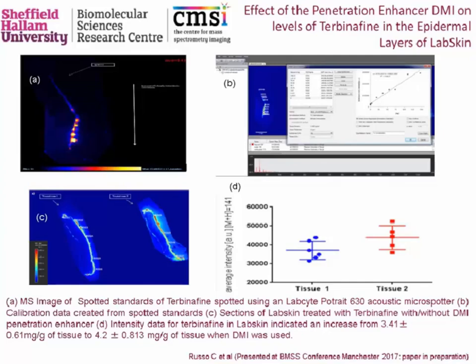And what we can do from that array of data, using the MSI-Quant software that was developed up in Sweden in Uppsala by Patrick Kalbach, is we can define regions of interest. It's very important when you're doing quantification in mass spec imaging that you matrix match the standards and the analytes.